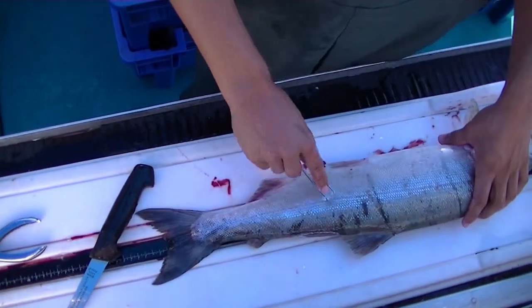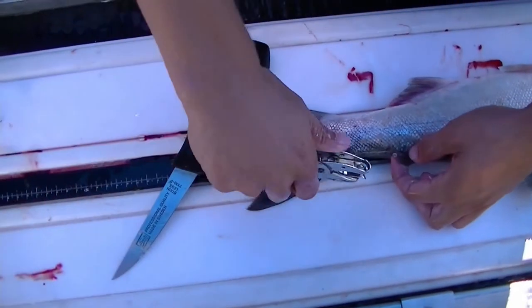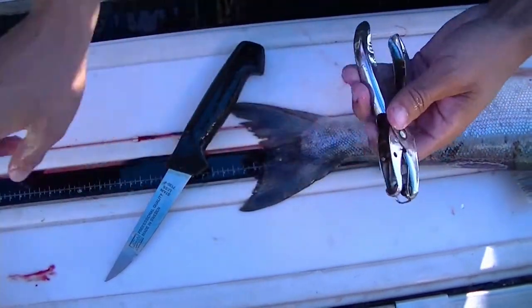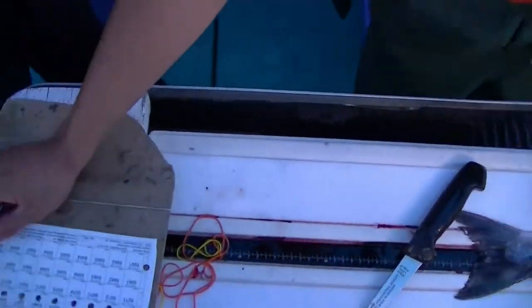A single scale is then collected from a specific location on the salmon, just above the lateral line. Finally, a DNA tissue sample is collected from the adipose fin, then placed on a sheet of Wattman paper, which binds, dries, and preserves the DNA tissue.